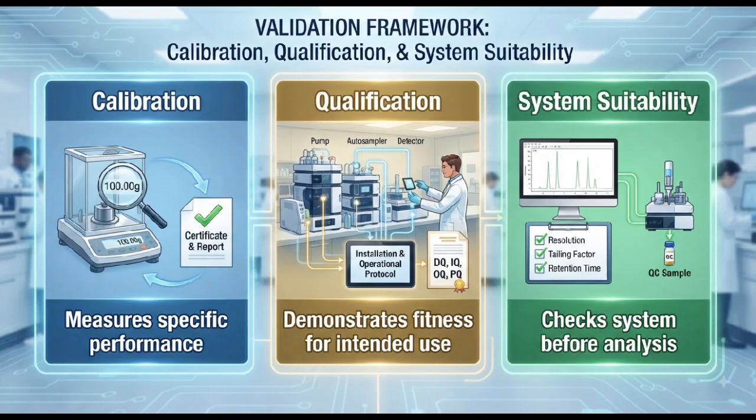Calibration versus qualification versus system suitability. One common question is, what is the difference between calibration, qualification and system suitability? Calibration generally evaluates a specific measurable characteristic against a reference standard. Qualification demonstrates that equipment is appropriately installed, operates correctly and performs as intended.